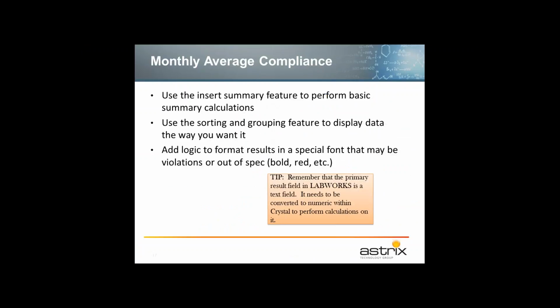So the insert summary feature can perform those basic summary calculations. You can use the sort and group feature to display data the way you want it, and then you can add logic to format those results in a special font that may be in and out of spec, bold, red, etc.